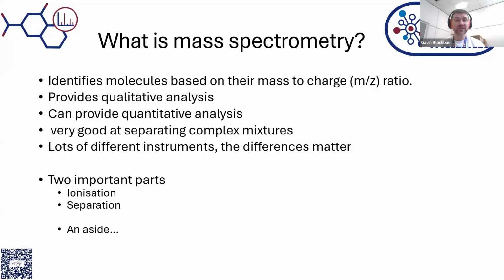And it's not just the differences in the instrumentation, but generally it's the differences in the lab. So what we'll also discuss is the two important parts I think you need to understand when someone's talking about mass spectrometry, and that is how we ionize those molecules, so how we make sure that the instrument can detect them, and then the separation in the analyzer, how we separate those molecules out, and what factors with those analyzers determine how accurate we can be when we pull those things apart.